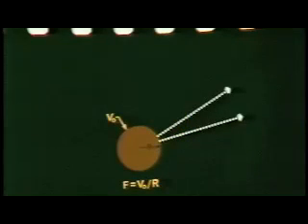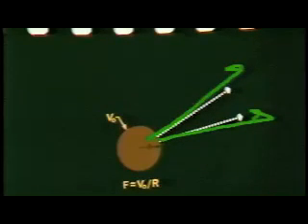Thank you. Okay. I'd like you to imagine, for those of you who remember your elementary physics courses, that we have an isolated metal sphere in space, a sphere whose radius is r. Now, if we create on the surface of that sphere charged particles by some means, we know that if we apply a potential to that sphere, there will be electric field distributed in space around it, and those charged particles will diverge from the sphere if they're allowed to do so.